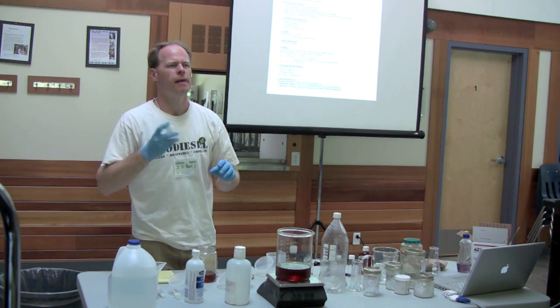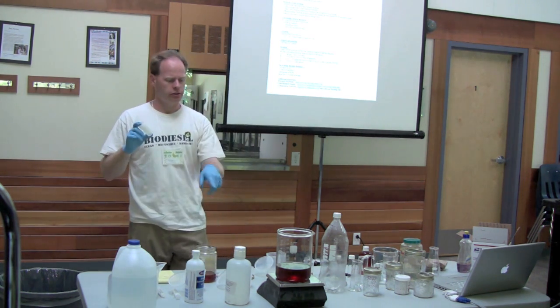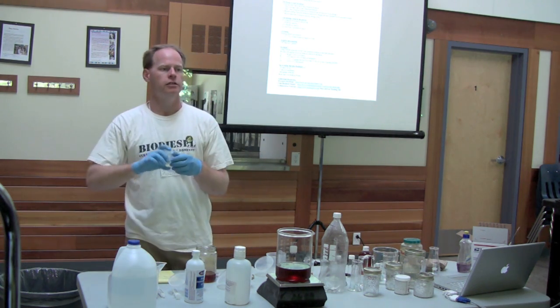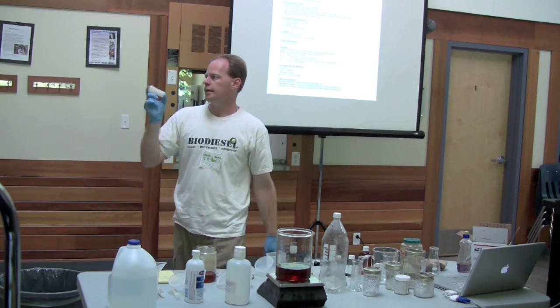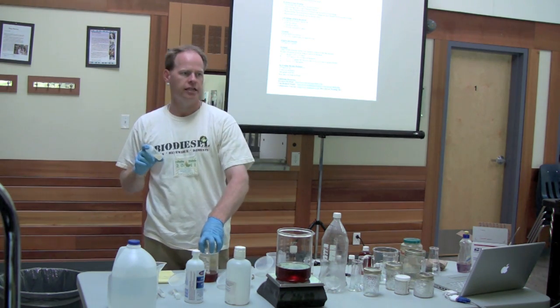If the alcohol is neutral, you should be adding virtually nothing. If it's absolutely neutral, we will do one here in a second, when you add some titration solution, it should instantly change. Just the tiniest little drop will change it. When you're trying to titrate, if you're using oils that are thick, like fats and lards, it's a good idea to heat this stuff up.